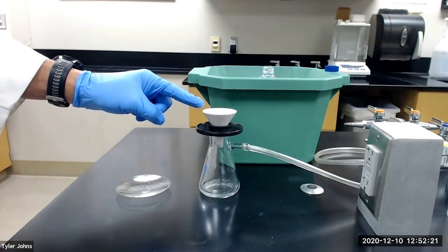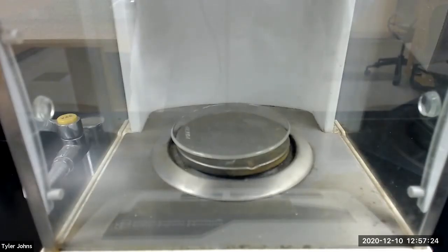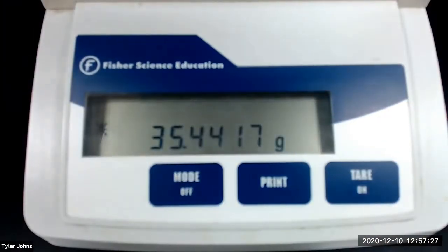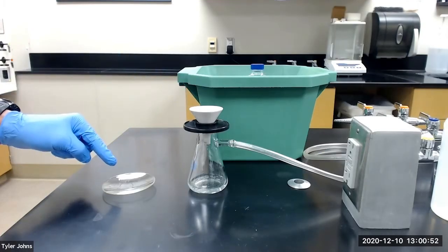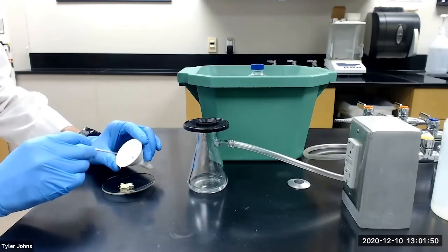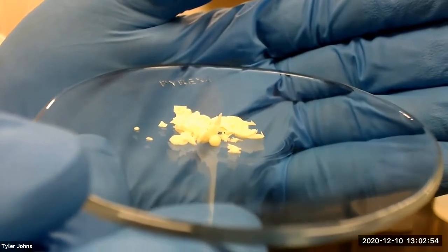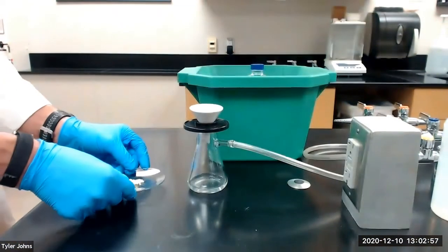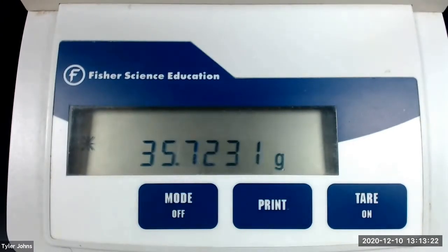While the crude benzil product continues to dry, we will pre-weigh a watch glass. The mass of the pre-weighed watch glass is 35.4417 grams. We will next collect the crude benzil product on the pre-weighed watch glass. The mass of the pre-weighed watch glass and the crude benzil is 35.7231 grams.